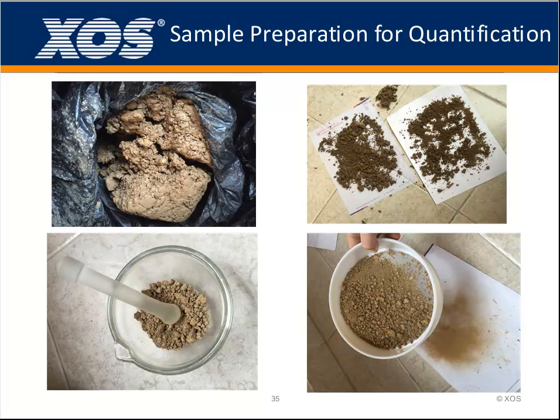And the third step is to sieve it with a mesh. There will be a standard operation method in different countries. So we need to check the technical guide, regulatory process, then we just follow it. After that, we get very tiny particles, then we can do quantitative analysis, and we can get the same results as with the ICP or ICP-MS method.